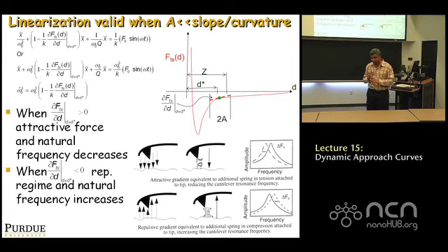So if that green dot were to the left, the force value is still negative. So what I'm saying is, be aware of three different concepts. One, the mean force, the static force on a cantilever, can be attractive or negative or repulsive. And the gradient that it encounters can be repulsive or attractive, but they're not the same things, right? You can have a negative static force but have an attractive gradient, or you can have a negative, attractive force and have a repulsive gradient. So be careful about this.